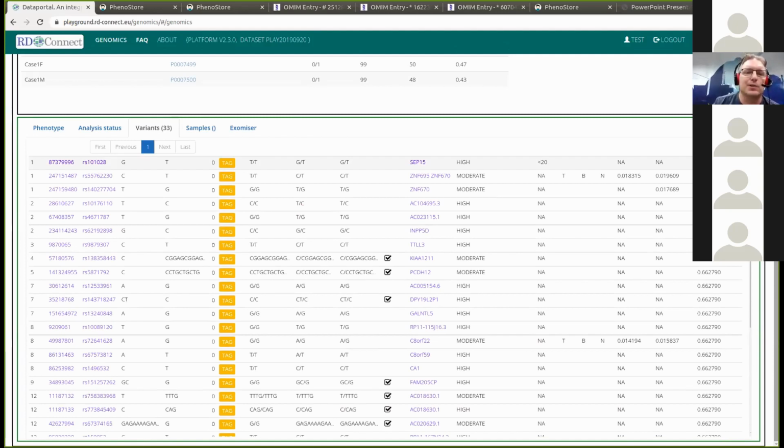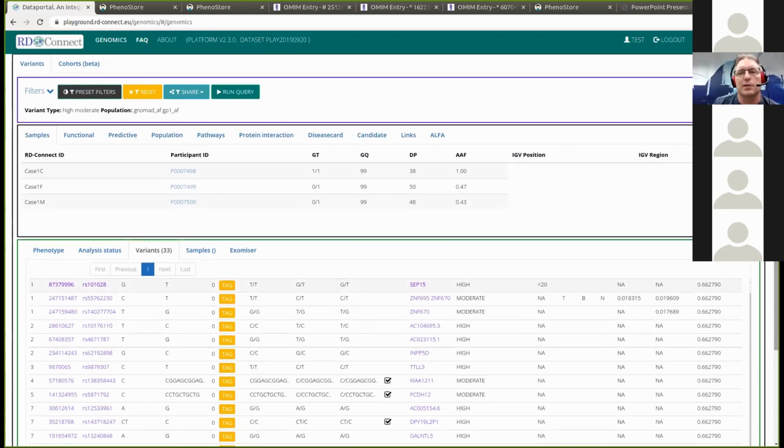If you're an expert in the class of disease that the child has, then you may be able to go through these quickly and identify which genes are not going to be of interest and which are going to be of interest. Of course, if the child has something unusual, you're not very sure what genes are likely to be involved.